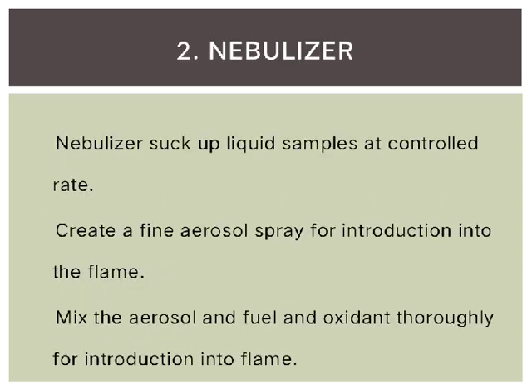Then the nebulizer. Nebulizers suck up liquid samples at a controlled rate, create a fine aerosol spray for introduction into the flame, and mix the aerosol and fuel and oxidant thoroughly for introduction into the flame.